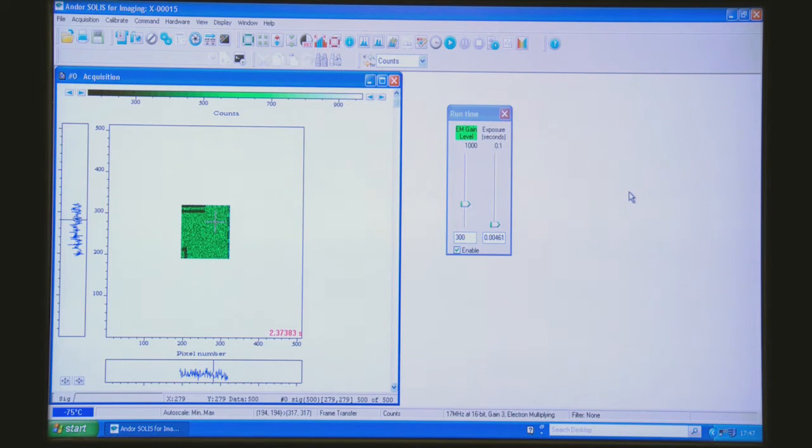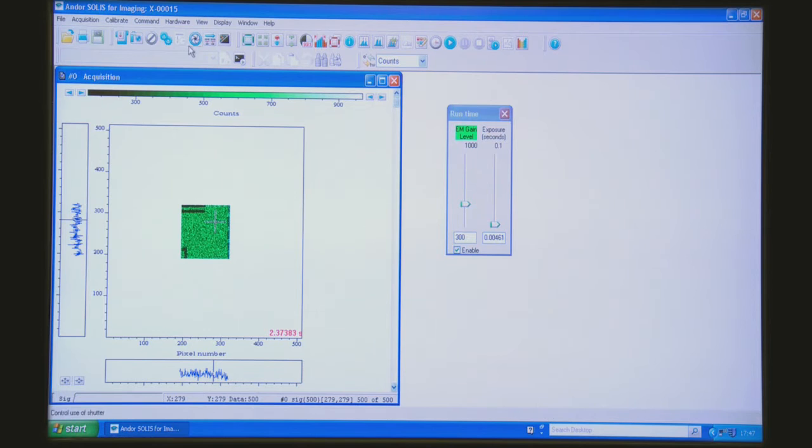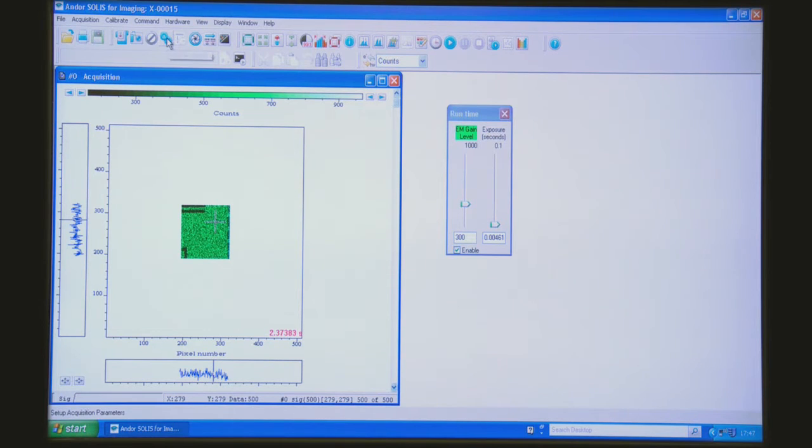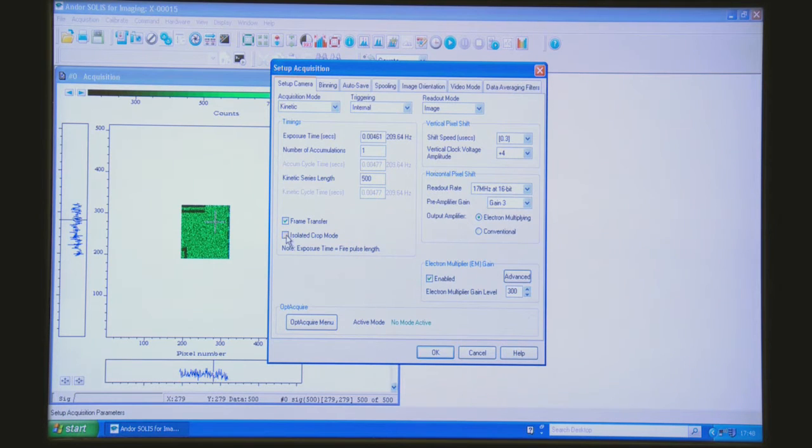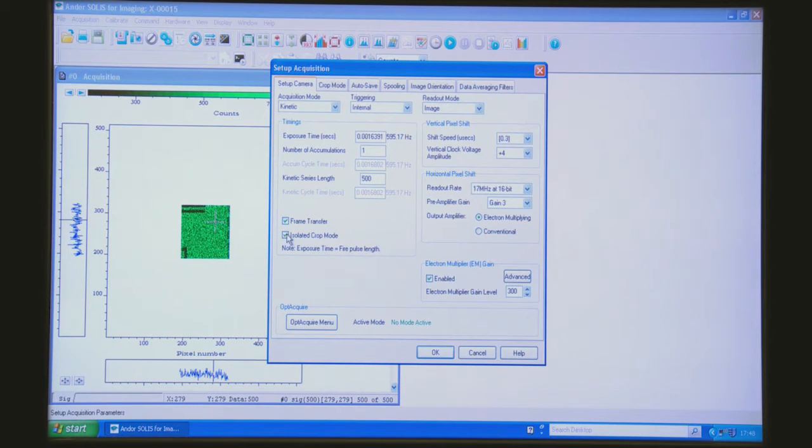Now there's one further trick which we can talk about to boost the frame rates even further and that is a mode called crop mode. We click on this, a new tab appears.